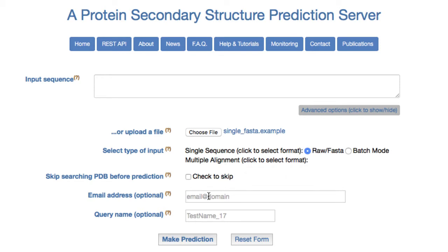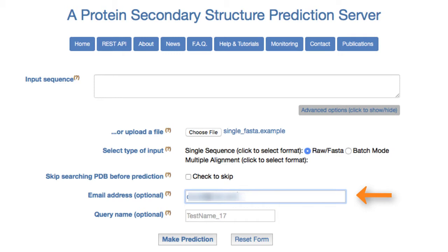If an email address is entered, an email is sent when the prediction is complete. The email will contain a link to all the results, along with a brief summary of the results. This step is optional.